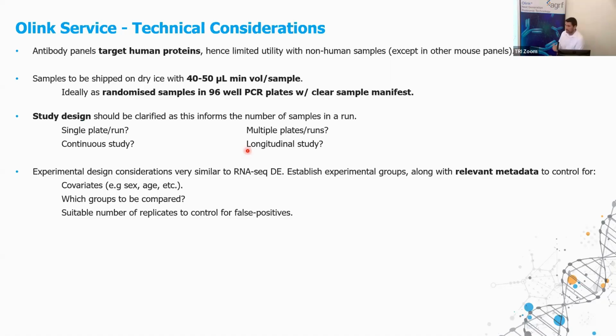Study design is important. If you have a study that you're interested in running Olink on, please by all means do come speak to us, and we'd love to hear about it. Specifically, if you want AGRF to perform the bioinformatics, it is important that you tell us what comparisons you're actually interested in, and if there are any significant covariates, providing enough information about the samples such that comparisons can be made.